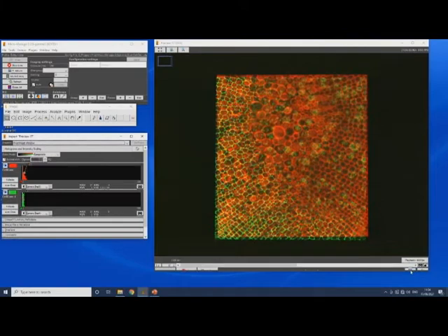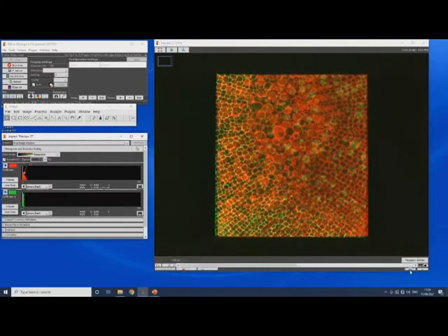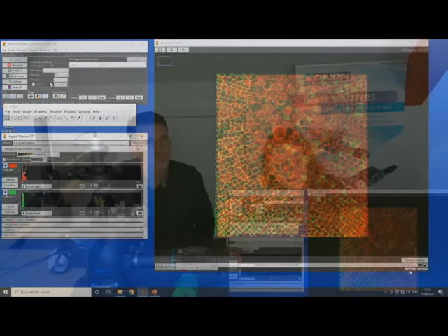There you go, well done. Right, there we go. I think that camera is still a little bit wonky. It only takes a couple of seconds to align, really. Famous last words. I know, it's the pressure. There we go.